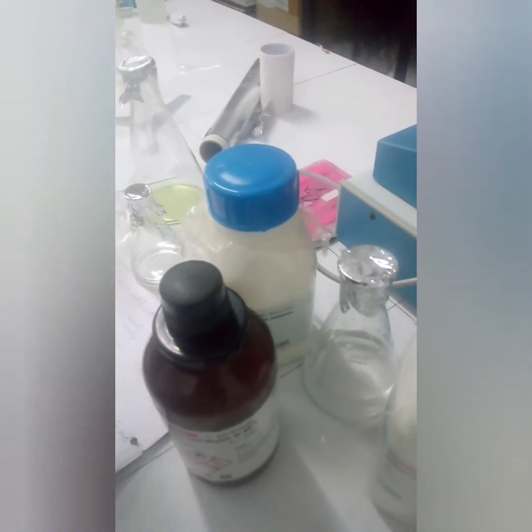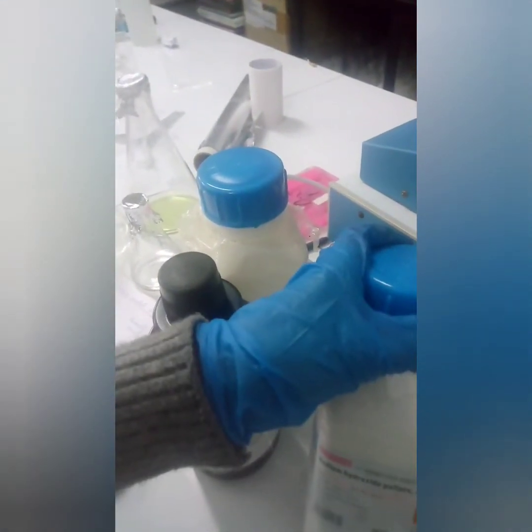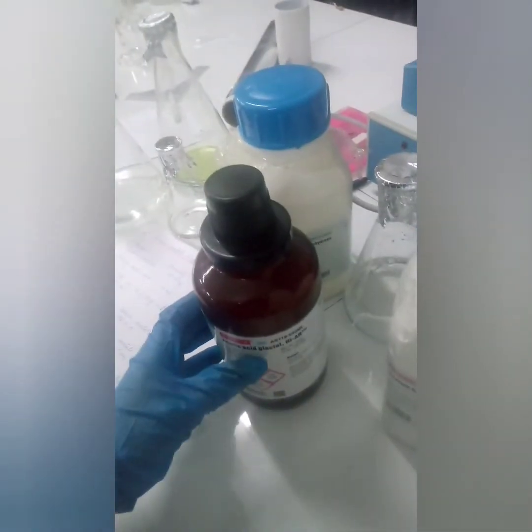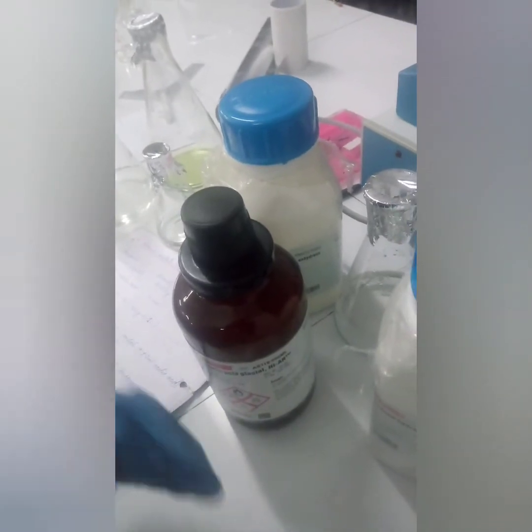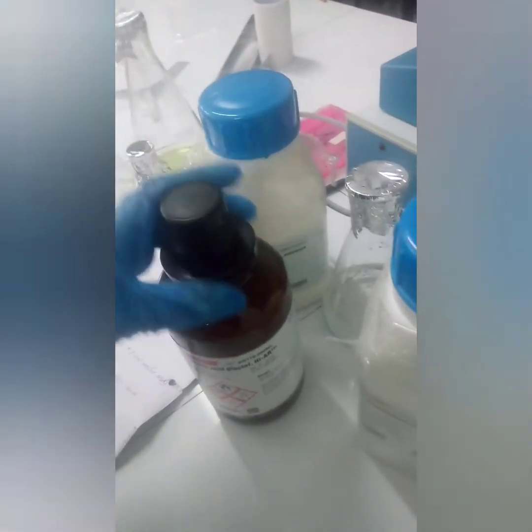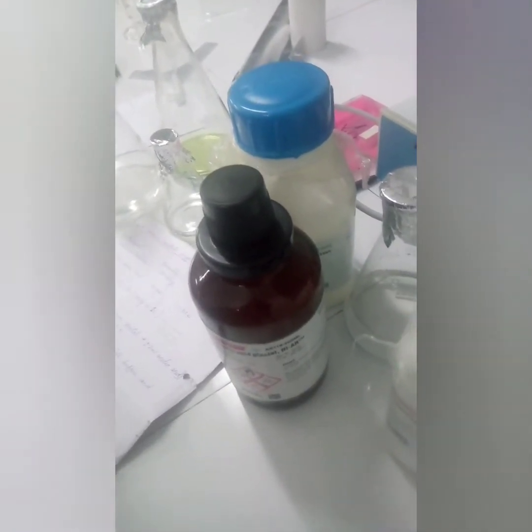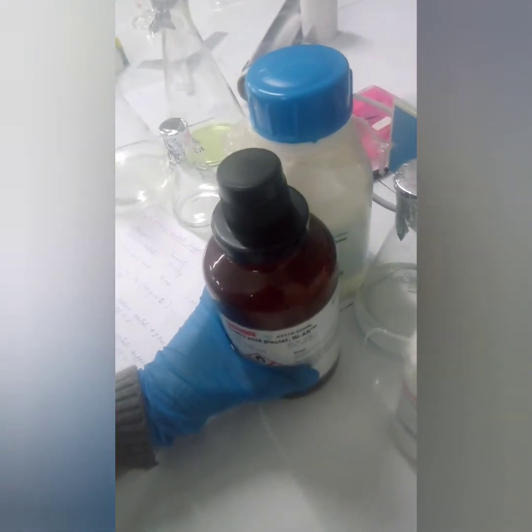For that we use a pH meter, and we also need sodium hydroxide. Why? Because acetic acid is acidic, so the pH will be below 5. In order to make the pH 5, we will use sodium hydroxide, prepared at 10 normal, which I have already prepared.